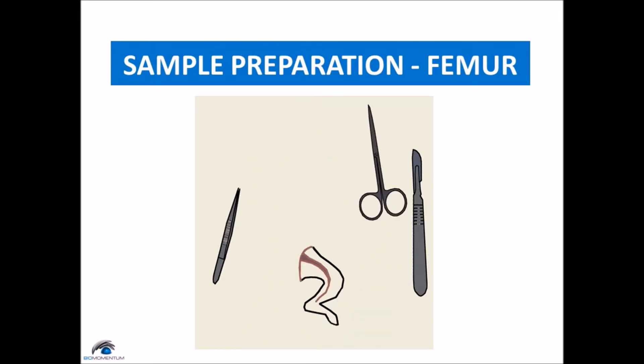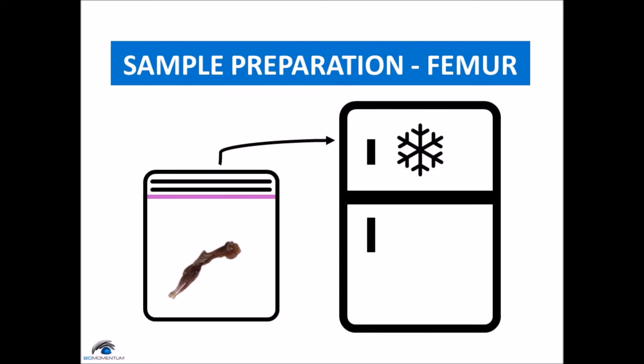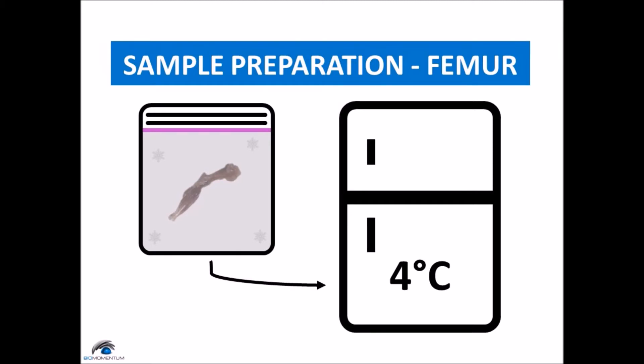Then remove the skin from the leg by lifting the skin at the base of the leg with tweezers and cutting away the skin across the thigh and down to the ankle. Note that after this step, the specimen can be frozen for prolonged conservation. If the leg is frozen, let it thaw at 4 degrees for at least 45 minutes beforehand.